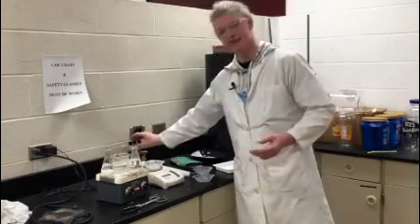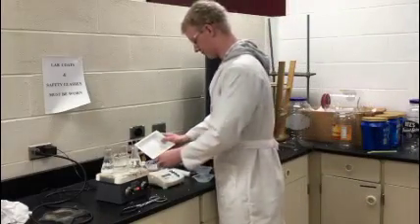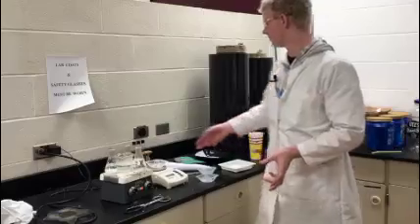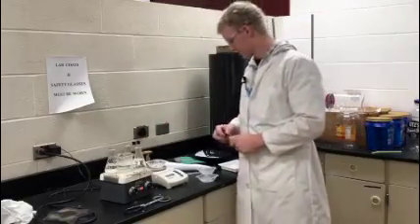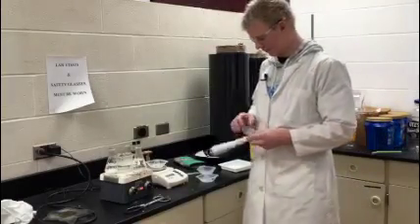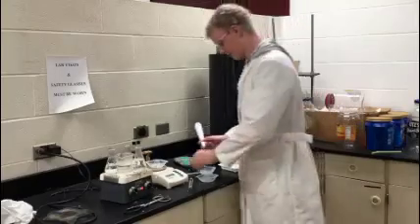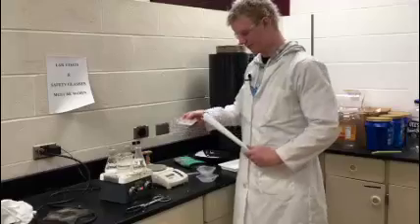Now we are going to start massing out our samples for this. Once you've massed out your samples, you can put them in a test tube. Take a test tube and put the same paper funnel you used for the boiling water in here. You're going to make sure it is tightened like that.